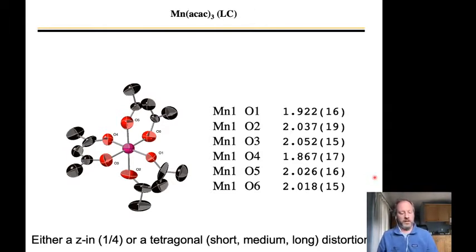So that is crystallography in a nutshell. There's way more to it than this, but I wanted to at least give you the basic introduction to crystallography. Take-home messages: one, diffraction is limited by crystal growth, really, anymore. We diffract the X-rays off the lattice planes, and we process that using modeling to get a final structure. And we can look at bond lengths, bond angles, and vibrational motion in the solid state.